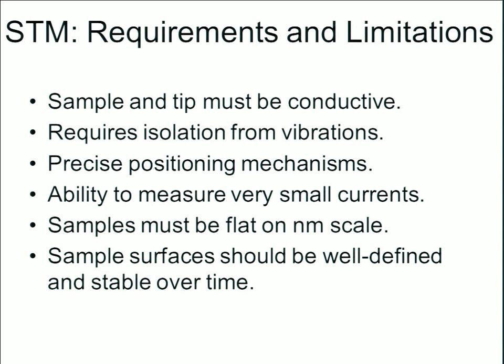So if you want to increase stability, you can do things such as remove the air, so do your STM operation in a low pressure environment, and also you can cool your sample using liquid nitrogen or some other means to basically reduce vibration and increase stability.